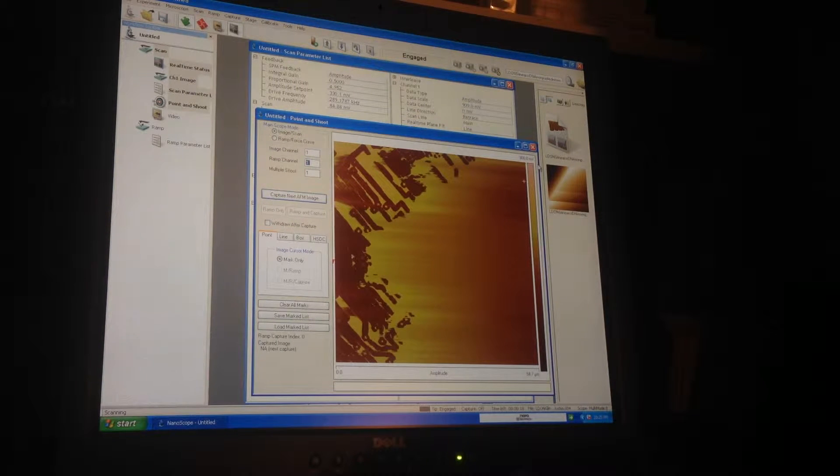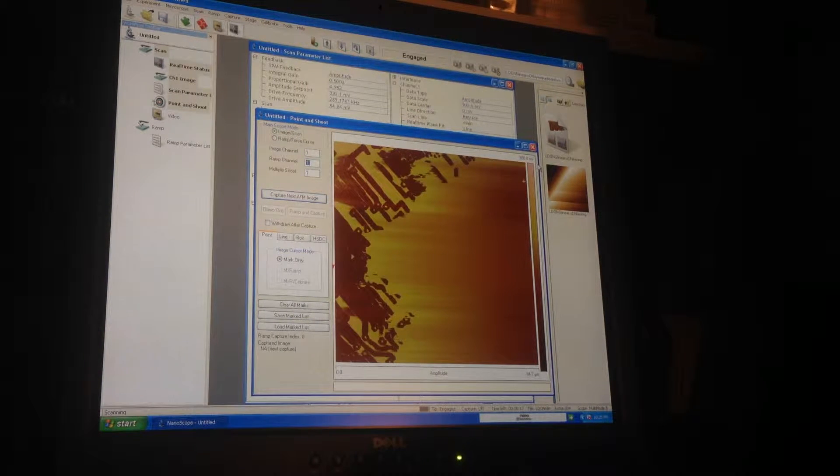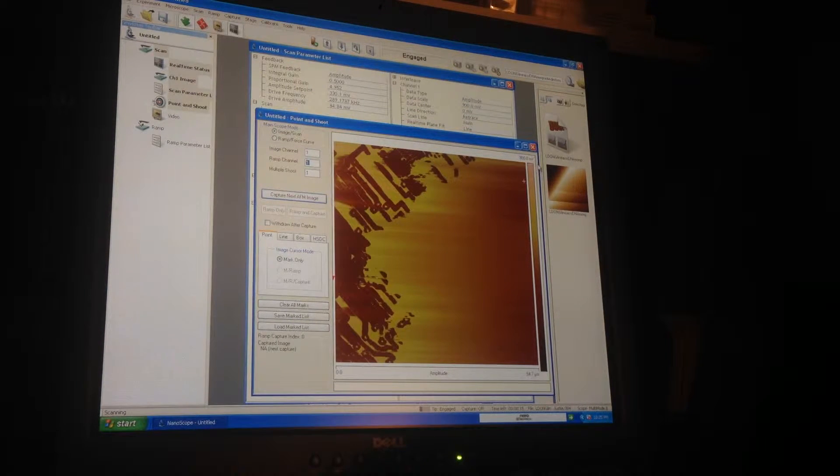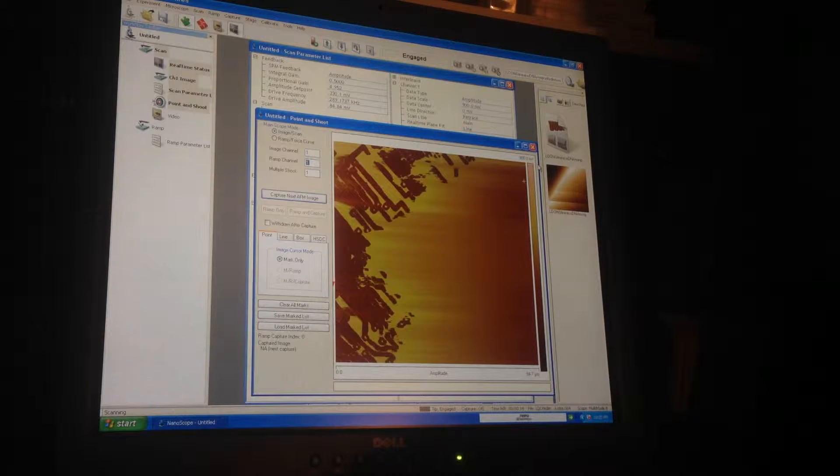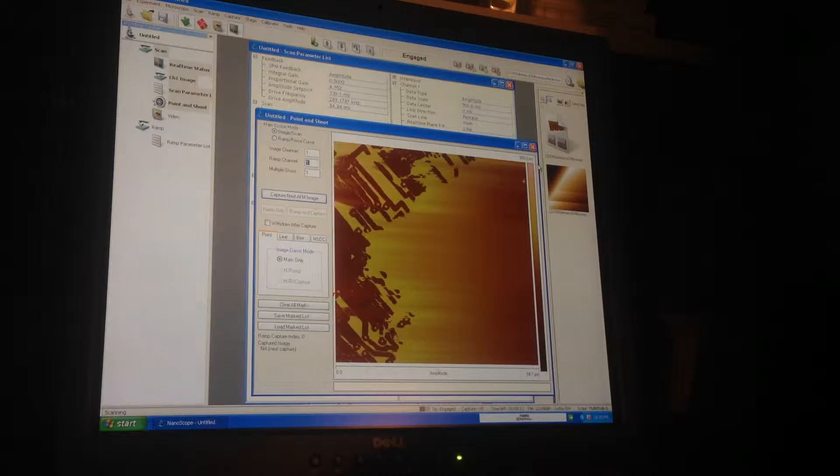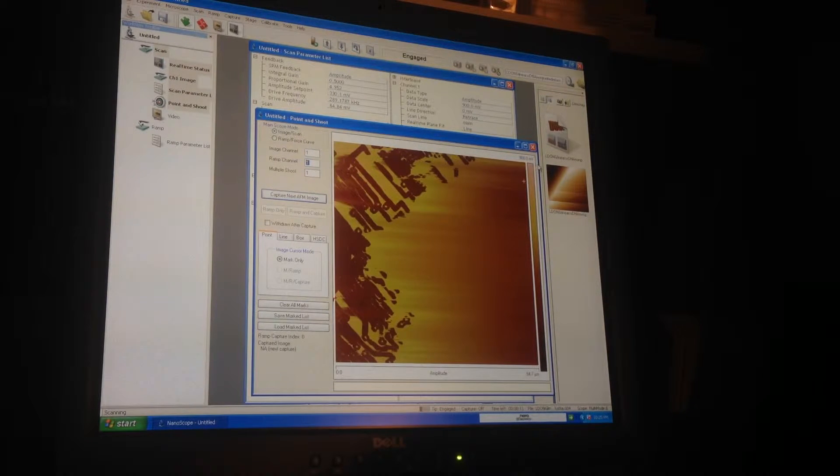I've just got the AFM acquiring an image and this is basically the first image that I've been able to get out of the AFM.